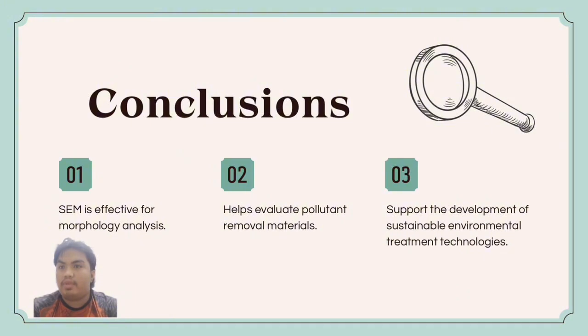SEM provided valuable visual evidence that helps researchers evaluate the effectiveness of biosorbent and biochar for wastewater treatment. Therefore, SEM remains an important tool in environmental research and will continue to contribute to the development of sustainable pollution treatment technologies. Thank you for your attention.